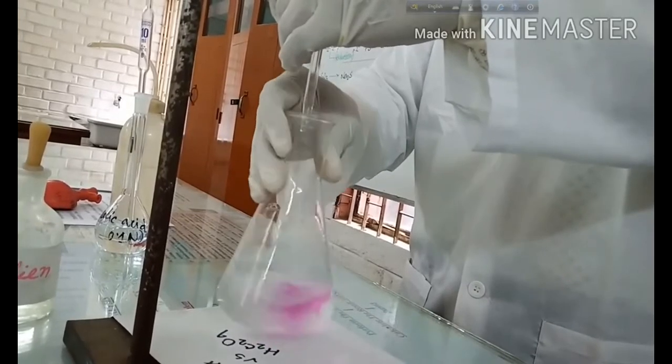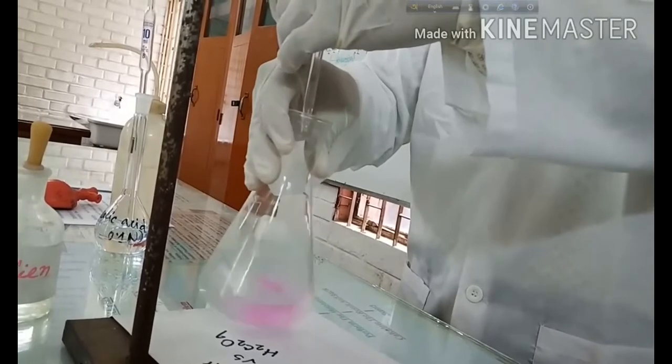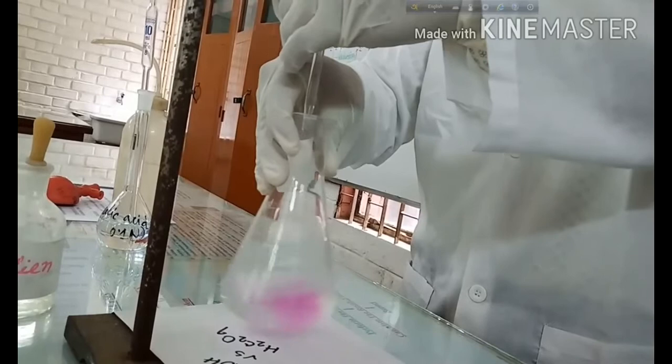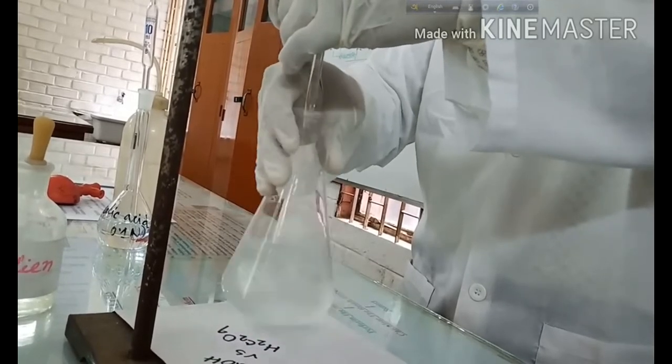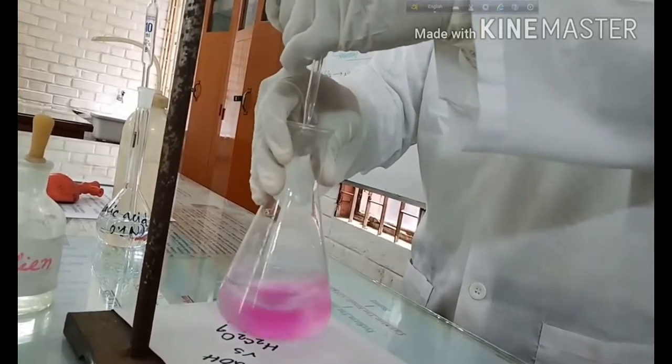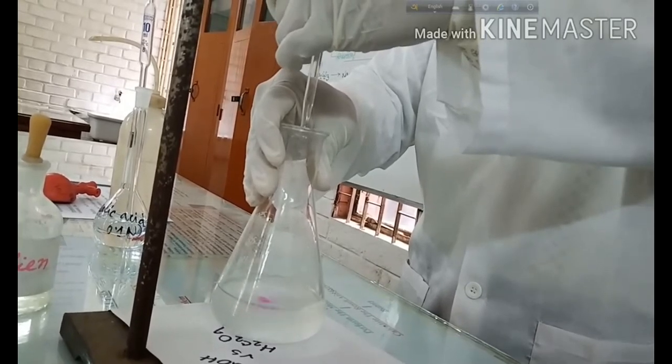So we know when phenolphthalein gets a basic medium, it will be ionized and show the pink color. This is the reason that we are using this type of indicator for acid-base titration.